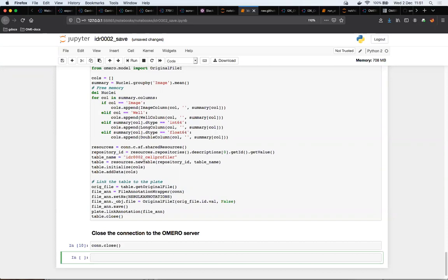So that's something to keep in mind, because with a CSV file, when they are small, that's fine. You can open them in Excel, but when they are extremely big, when you have a lot of features calculated, that's not going to scale. So that's why you have something a bit more flexible, where you can actually mine the data, ask the server, give me what I want, because that's what I'm interested in at that point in time.